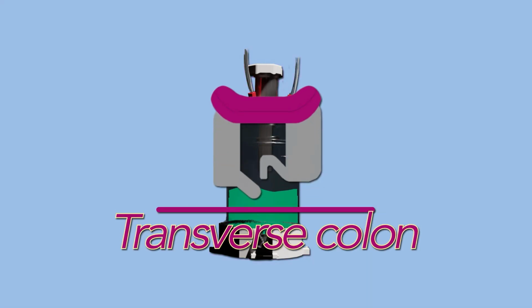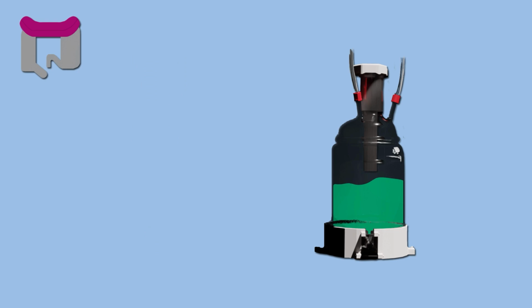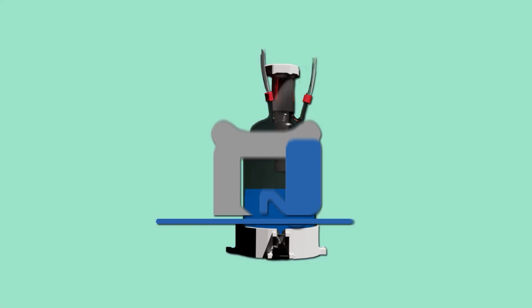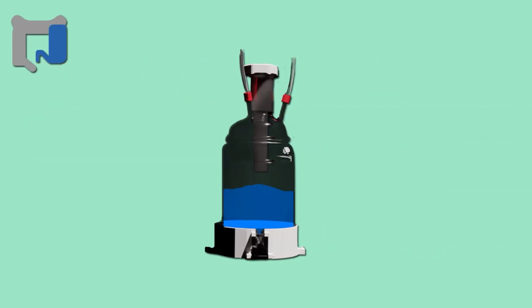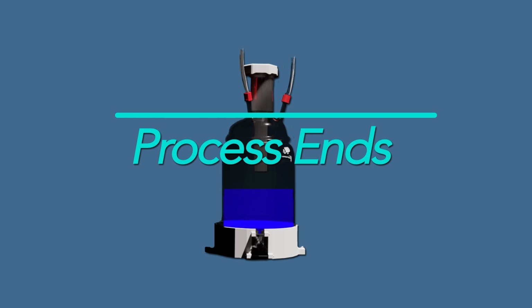Transverse colon. The content is transferred from the ascending colon to the transverse colon. Just like in the previous stage, continuous monitoring of the pH adjustments, temperature, and agitation of the reactor takes place. Descending colon. The content is transferred from the transverse colon to the descending colon. Continuous monitoring is sustained. And finally, the content is transferred to the waste container. The simulation process ends.